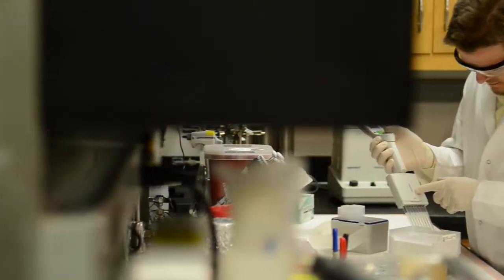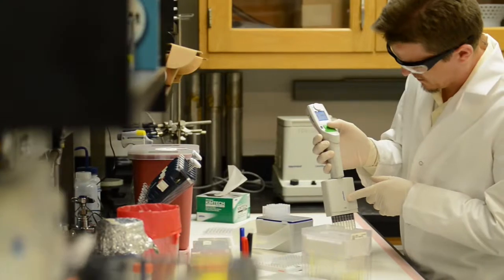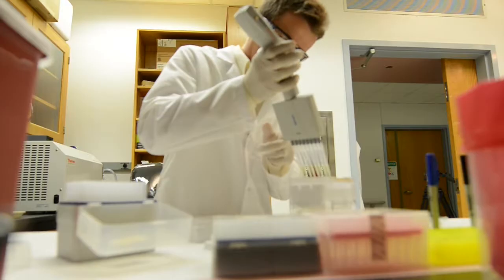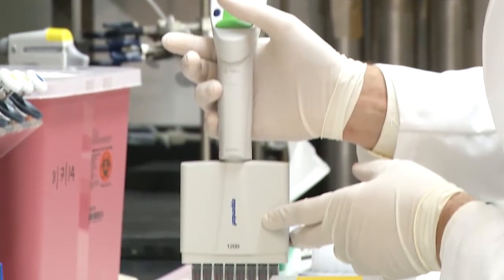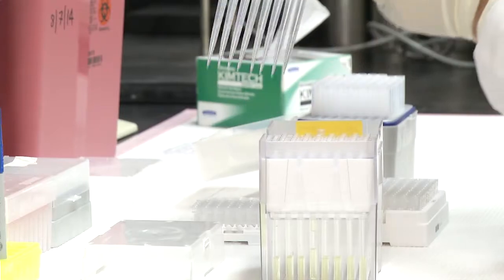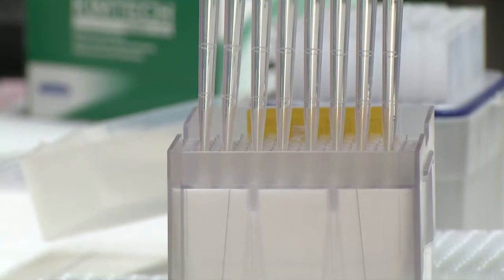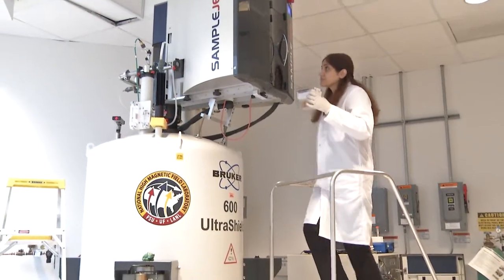My role in Core 2 is really the development of C13-based NMR methods. One of the major projects that I'm working on is INADEQUATE mixture analysis, and with several collaborations, we've managed to really automate the process of analyzing complex mixtures using INADEQUATE, which gives the carbon skeleton of a molecule as well as chemical shift information, and is an incredibly powerful technique. We're putting most of our efforts on C13 NMR, as well as getting the routine stuff more automated.